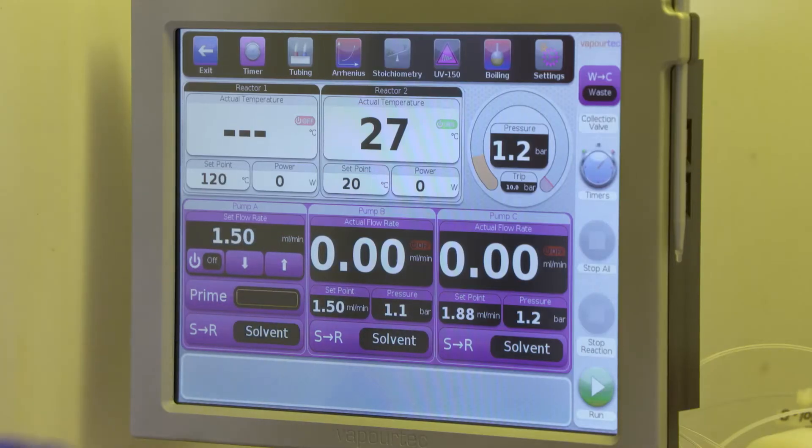The E-Series has push button priming so all I need to do is push the buttons and let it take over.